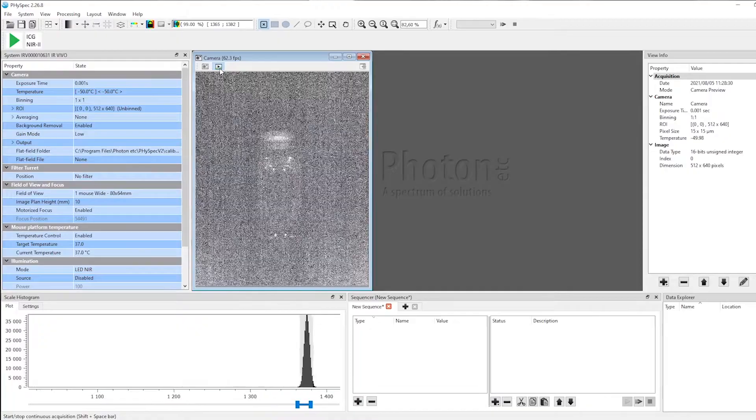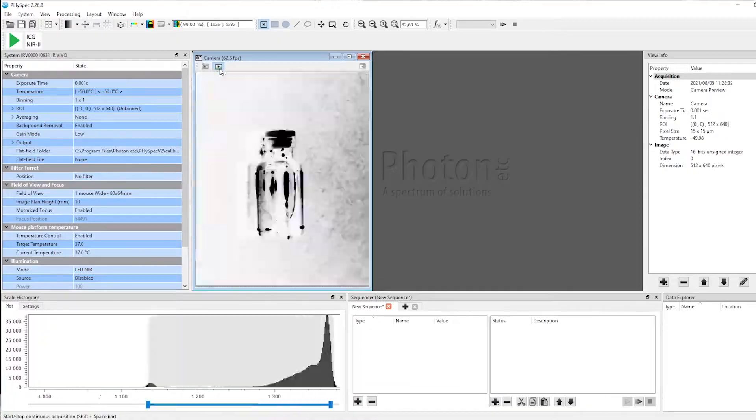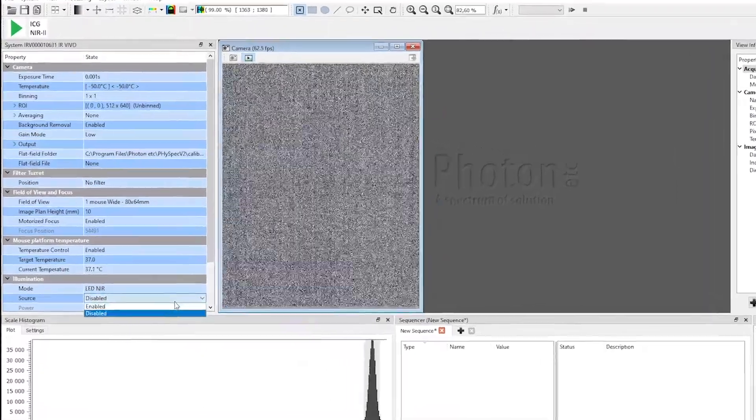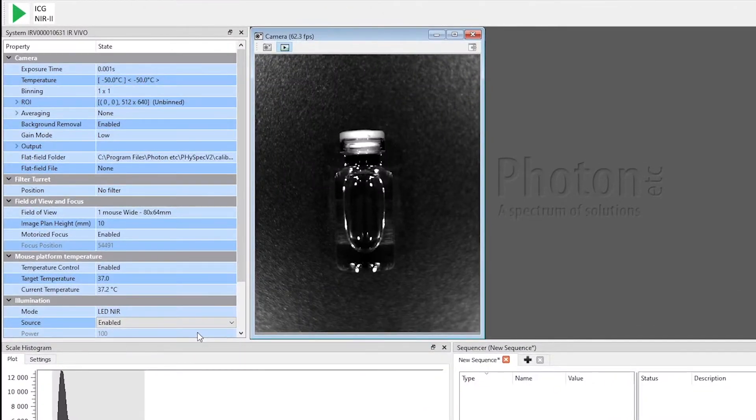So I'm just going to place it in the system and you can see it live without recording the video. As I close the door, the image disappears on the live view because it's light tight. I need to enable the LED near-IR source to view the broadband image.